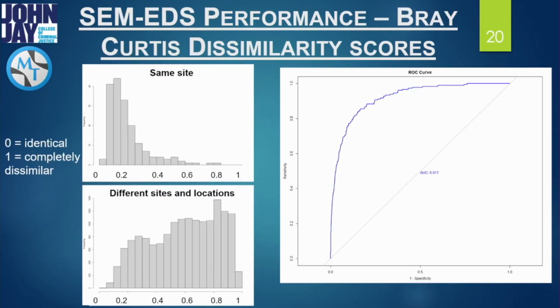That gives us a lot of big numbers per sample to characterize. We use the abundance profile for each of those samples as the characterization of that sample, and then we did all pairwise comparisons using a metric called Bray-Curtis, which is used in ecological research for comparing different sites based on living organism species levels. We're just adapting this to our method here with mineralogy.